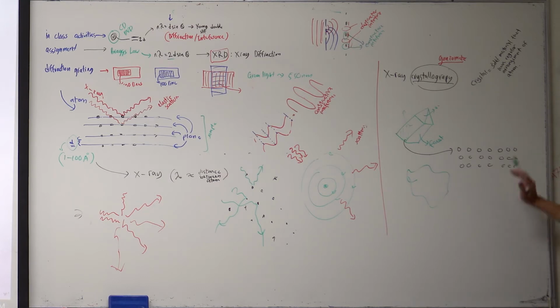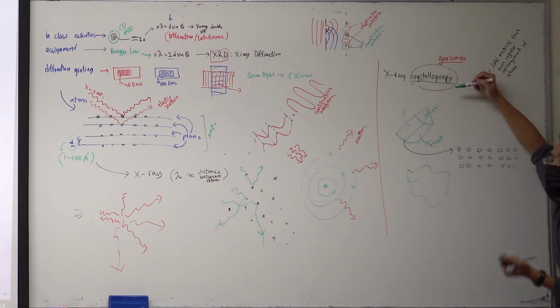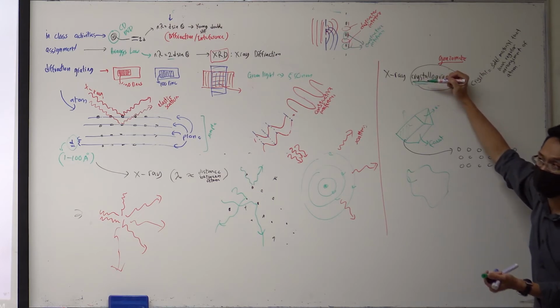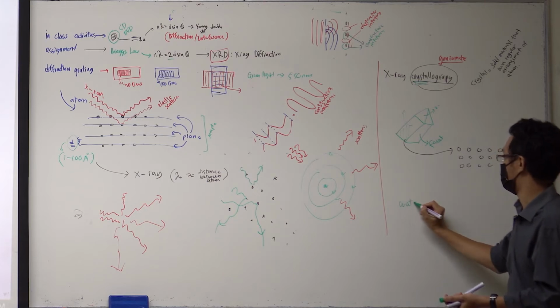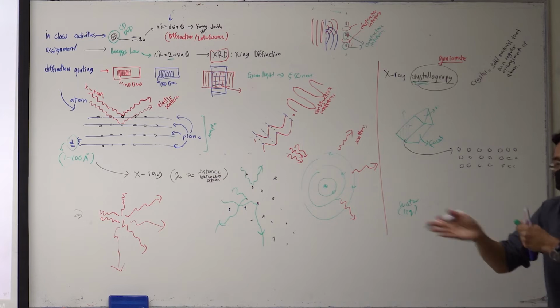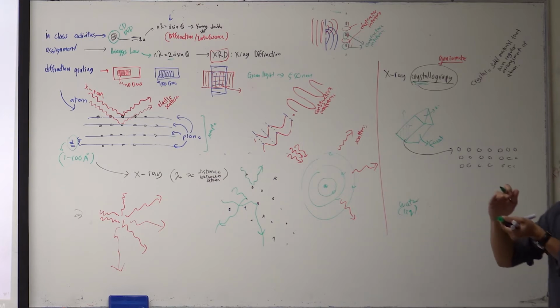So how then? In order to perform X-ray, you need to have a crystal first. You need to have the crystal first. So crystal, for example, water. Let's say water. Water by itself is a liquid. The atoms move here and there. So it's just not stable and also has no arrangement.